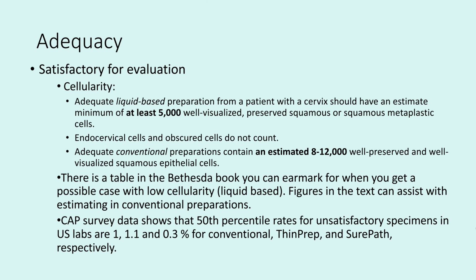For conventional preparations, which some of the trainees might not know what that means, conventional preps, versus the liquid PAP, you do the swab of the patient's cervix, you suspend it in liquid, and then that's made into a slide. For conventional PAP, you do the swab or the thing that looks like a pipe cleaner, and then at the bedside, the clinician rolls it onto a slide and fixes it right there, and then that's stained by the laboratory. It's much less expensive than the liquid-based prep. It's not really used in the States anymore.